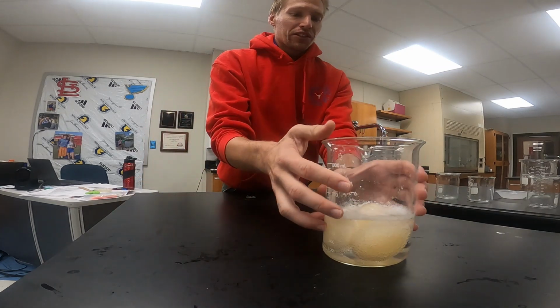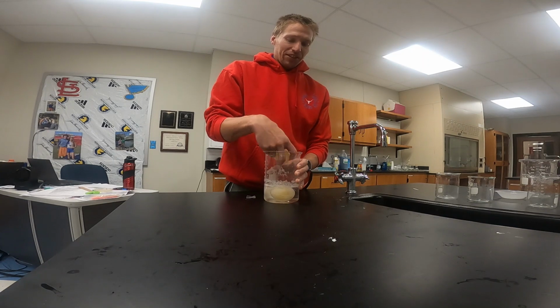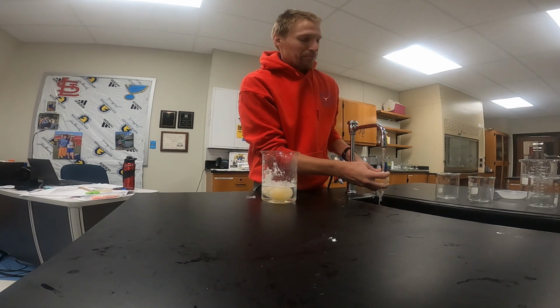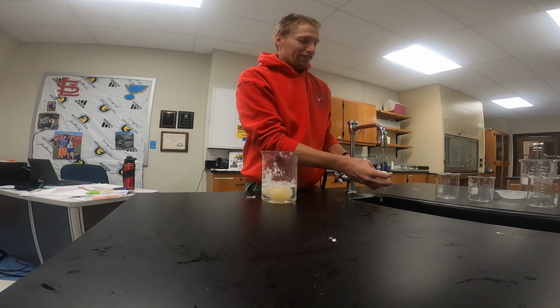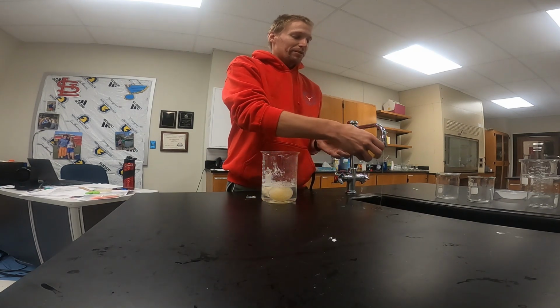So today we're going to look at water movement. We're going to start by using some eggs. These eggs have been sitting in vinegar overnight. By sitting in vinegar, they've lost the egg shell, so they no longer have that white protective shell.